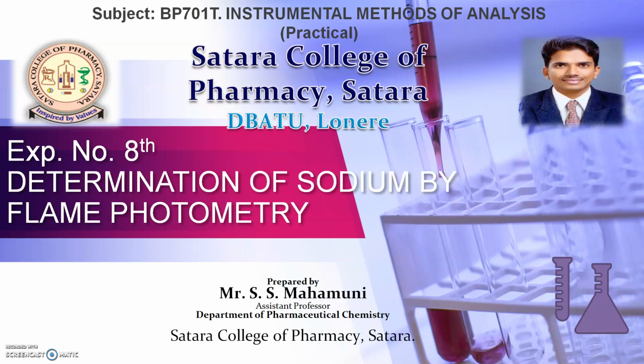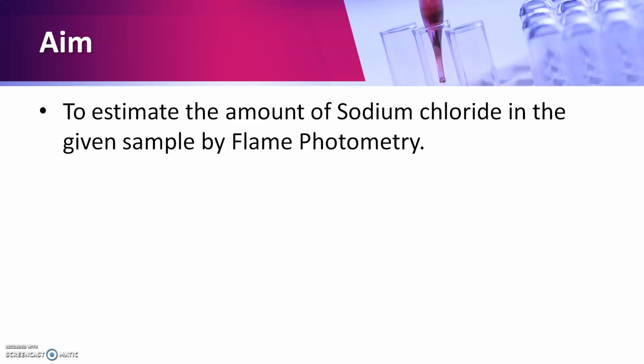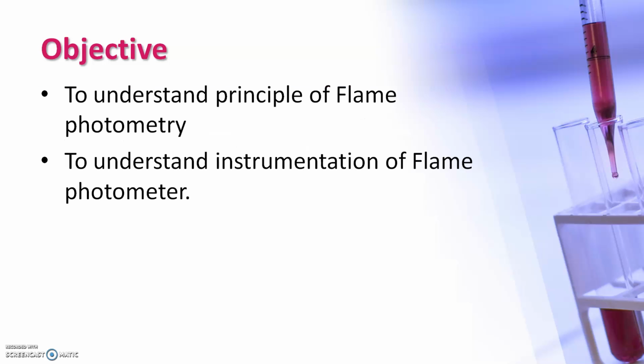Today we are going to see the practical of instrumental method of analysis for the final year B Pharm. The lecture number is 8, that is determination of sodium by flame photometry. So we'll start with the first, that is the aim. The aim of this experiment is to estimate the amount of sodium chloride present in a given sample by flame photometry. The next is objective.